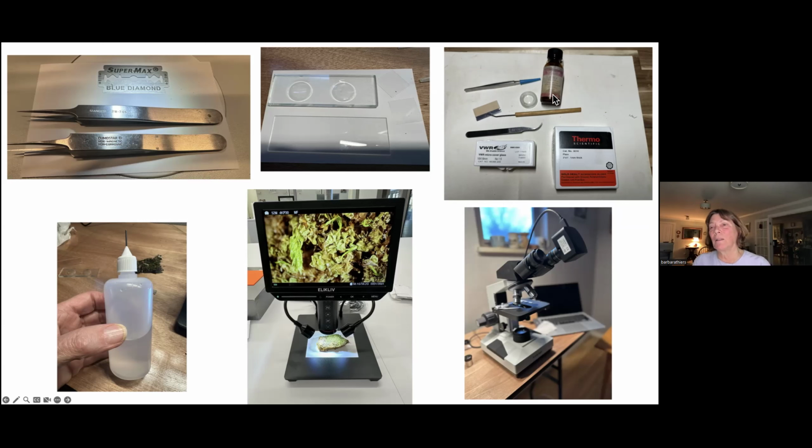And that's this bottle of immersion oil, which I think is probably 40 years old and it's still half full. So you could buy one of those for looking at things under 100x. It'll last forever. I'm very picky about my water bottles because I want just a very small drop of water.